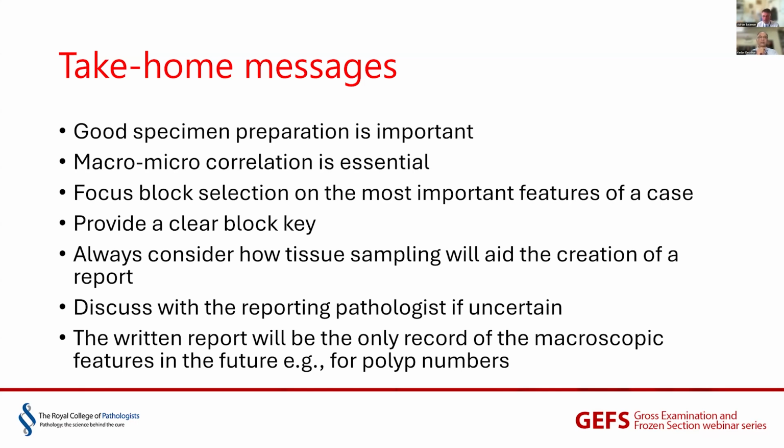As I've said, always consider when you take samples how they will help you create your final report. Discuss with the reporting pathologist, because you might be the reporting pathologist, and if you're not, you're cutting a specimen for someone who's going to be reporting. Always discuss a specimen if you're uncertain, or if there's something unusual or complicated about the specimen.